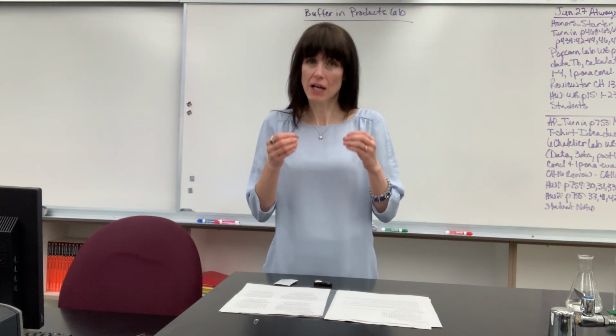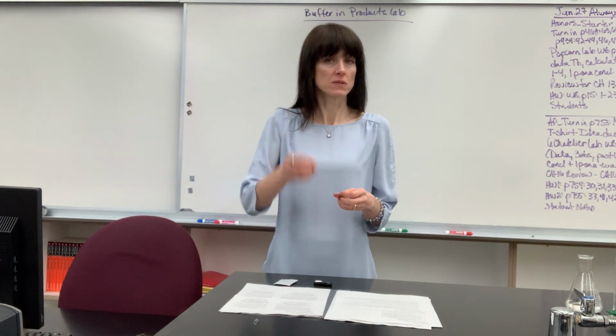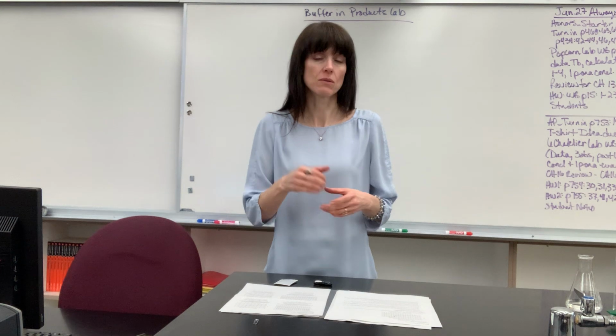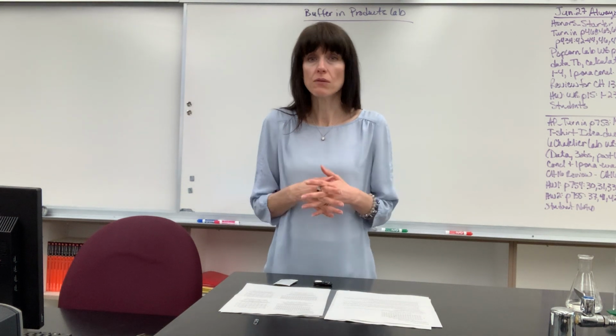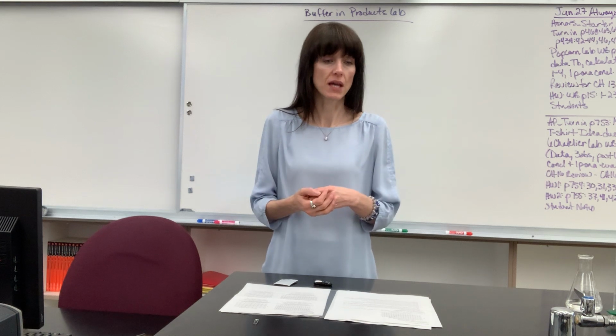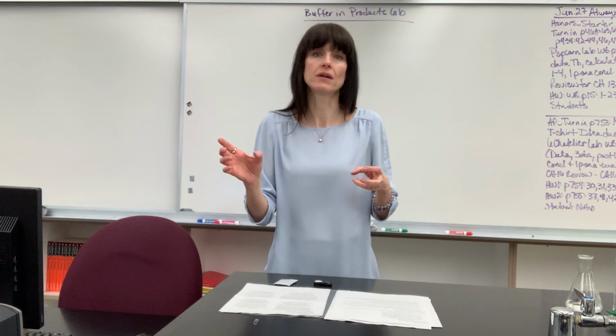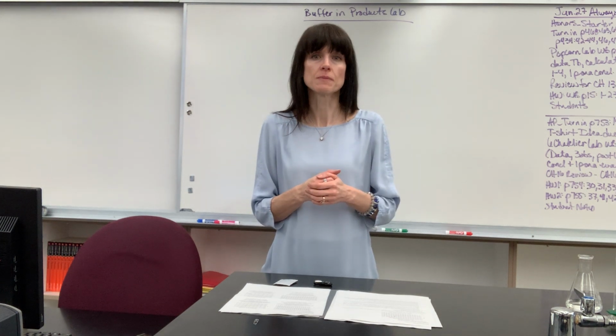You want to have at least 25 mils that you can test an acid with and 25 mils that you could test a base with. Let's say that you already have a liquid, pineapple juice. Then I would take 25 mils of pineapple juice, test it with the acid, and 25 mils of the pineapple juice, test it with the base.